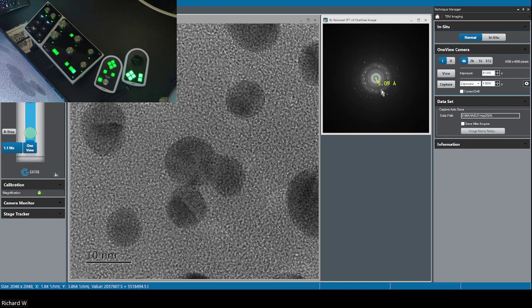If you have, say, 3 pixels between, you'd have one bright, one dark, one bright. Whereas if you have 5, then you have one bright, one in the middle, one dark, one in the middle, one bright. And so I think 5 is the minimum number you need to make that assessment of whether it's just noise or if it is actually a lattice fringe.